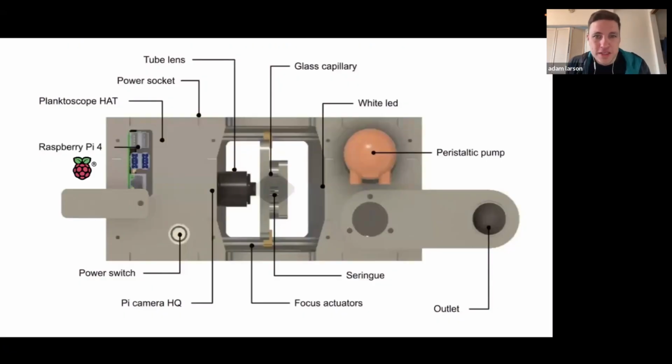And so what is the actual PlanktonScope? So this is the version we're at now. Again, this went through a lot of iterations, and that was honestly made possible by this community using it. So I have a background in protein biochemistry, so I was used to using, again, very expensive, kind of inaccessible machines that I didn't really understand. And so when Thibaut Pollina joined the lab, who got me involved in this project, he came from this maker community and showed that these things don't have to be so complicated.